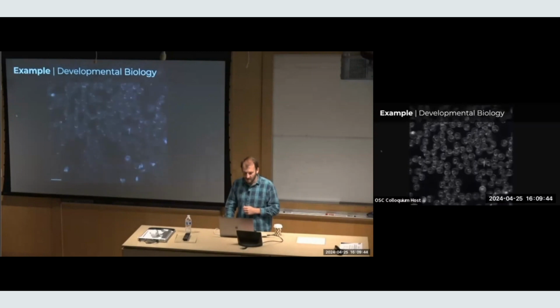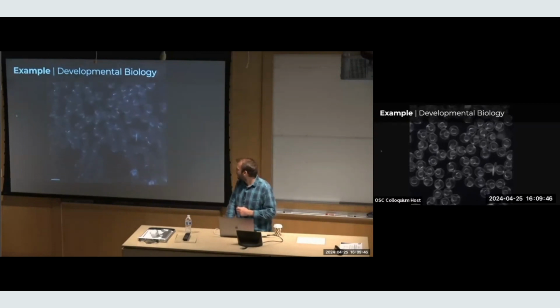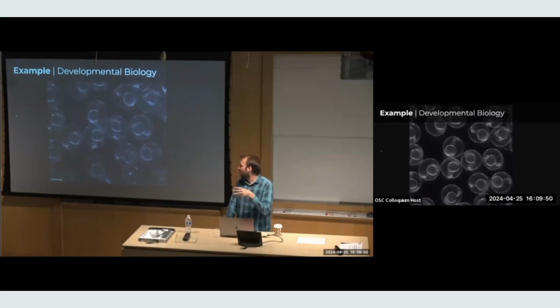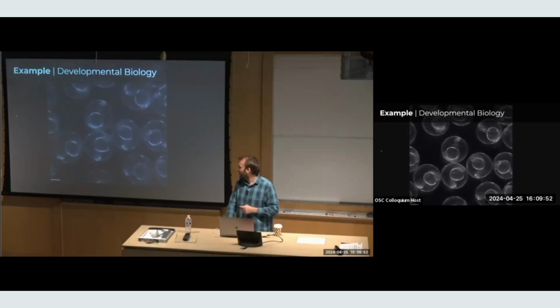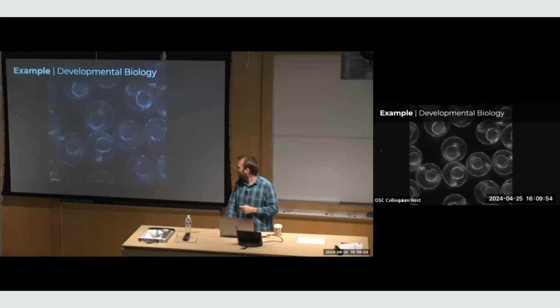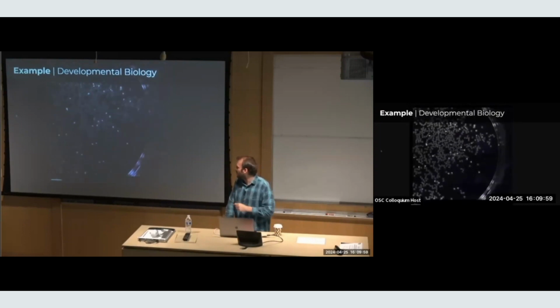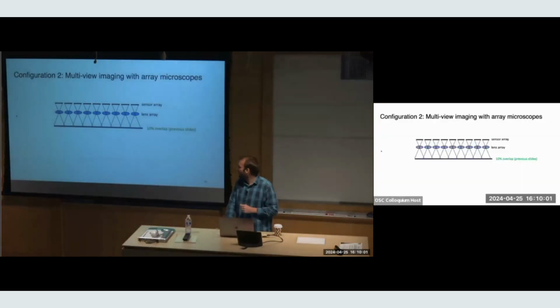Okay, this is just another cool video that we took. Oh, it's kind of dark. Of again those zebrafish larvae here in a petri dish. And they all kind of shake around and get startled, which is kind of interesting. So this is just showing the continuous field of view type resolution.